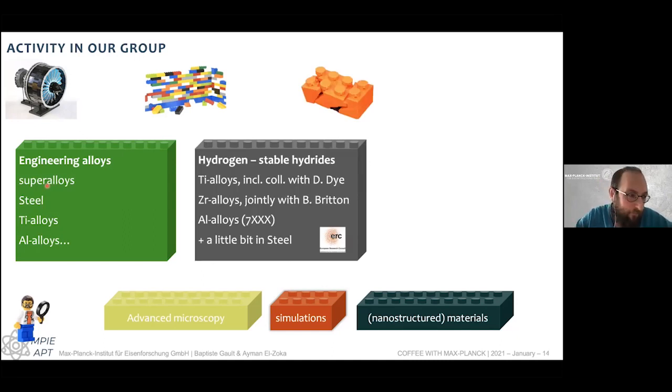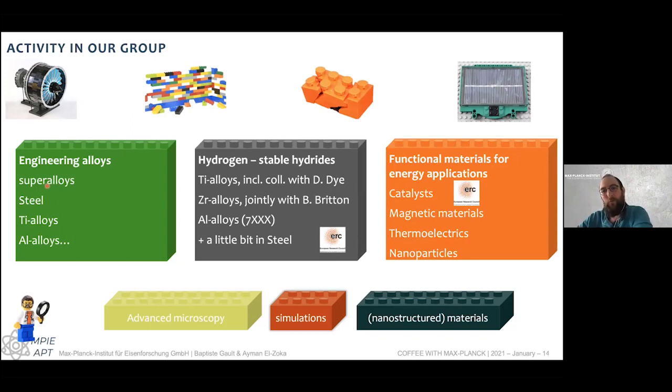We have a fairly large activity on hydrogen, trying to understand how hydrogen goes inside the materials, what it does inside of the material, and how it causes mayhem and causes materials to break down. And then we're also trying to push on the application for functional materials, so typically catalysts or magnets or thermoelectrics. Everything we do is in the context of trying to understand better how materials behave, to try and make them better in the end.